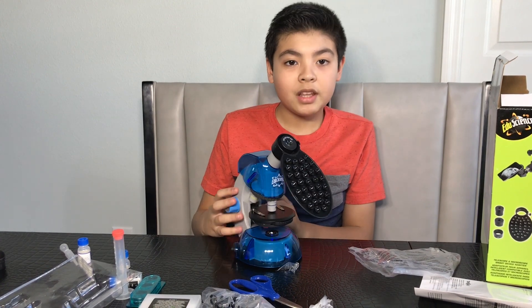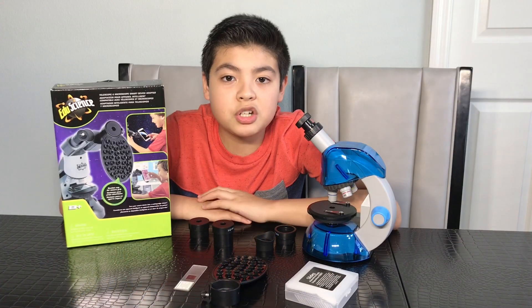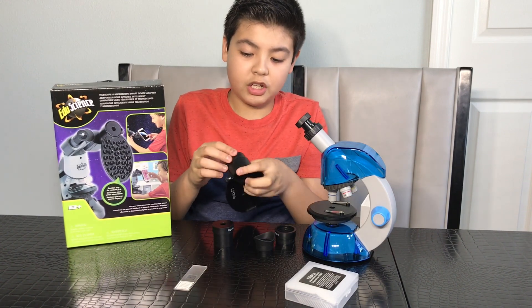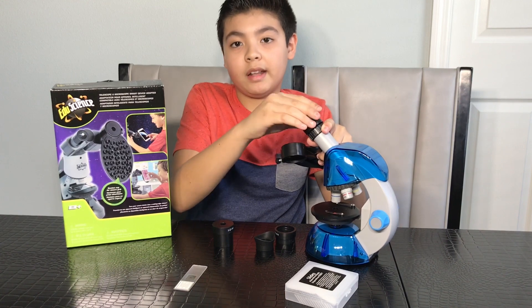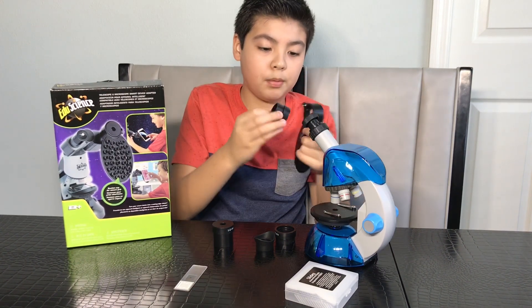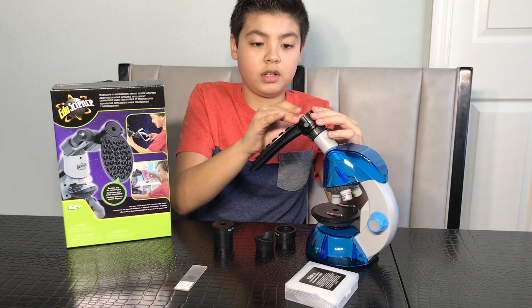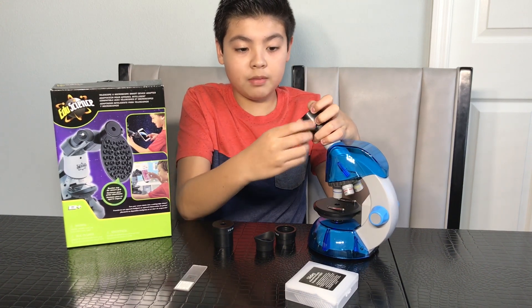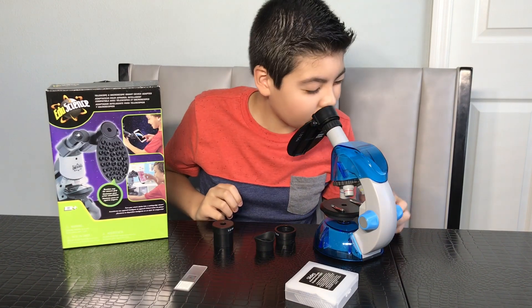We're going to have a cut scene to put the batteries in and turn the lights on, and I'll prepare the slide for you guys. Let me recap how to put it on. First step: you get this small piece and you just attach it in here like that. You screw it on — make sure it's tight or else your video is going to be very wobbly. Then you put this part on first and use the other piece as like your screwdriver. You have to do that first exactly. Now just lock it down. You want to make sure this is level, or else it's not really going to work. Screw it on and make it very tight — extremely tight. Then you look inside and you can see it.